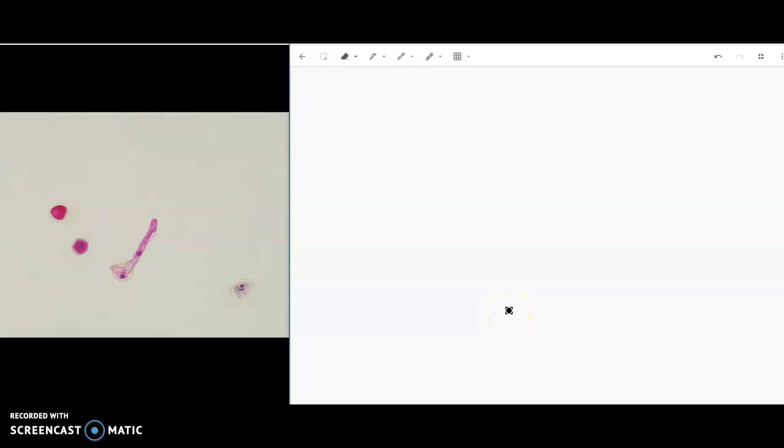Alright, so we're looking at the pollen grains right now. And so what we have are several stages of the male microgametophyte. So probably what we were seeing in the pine cone earlier, where we could only see kind of one cell in there, that was probably at the stage of the microspore.